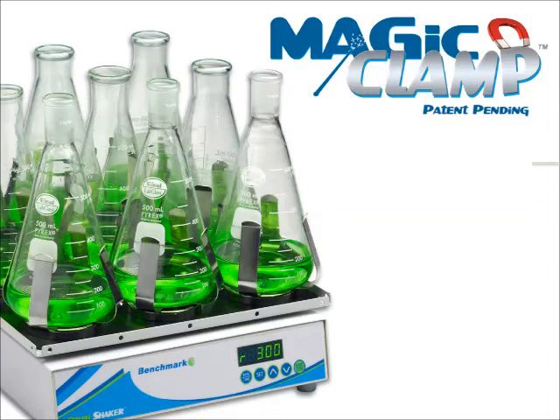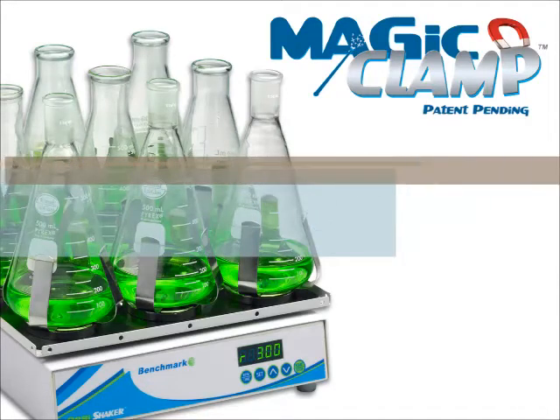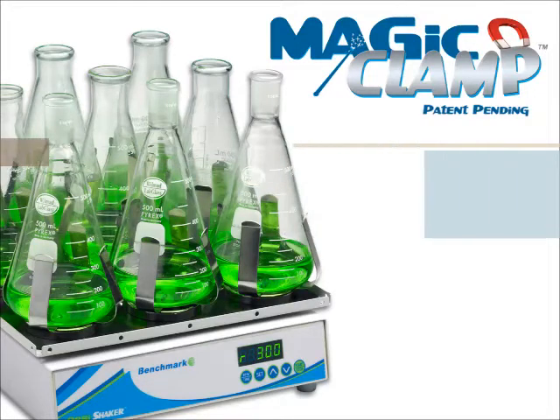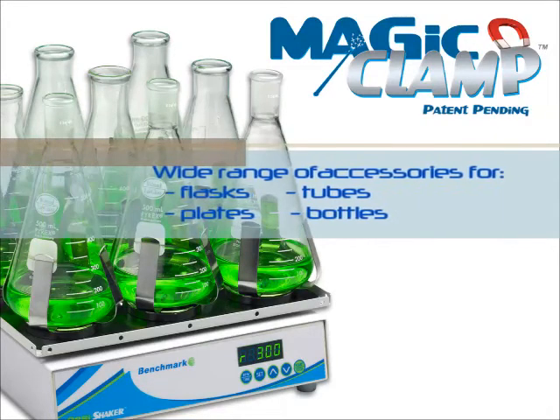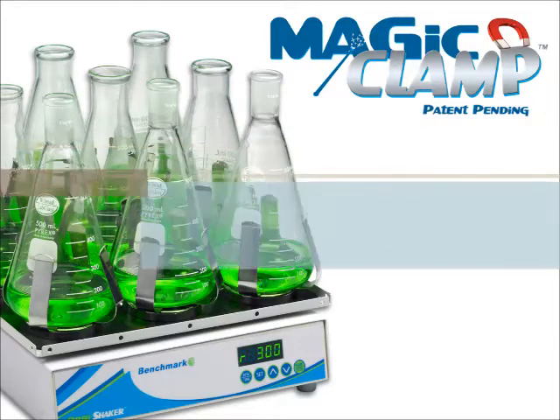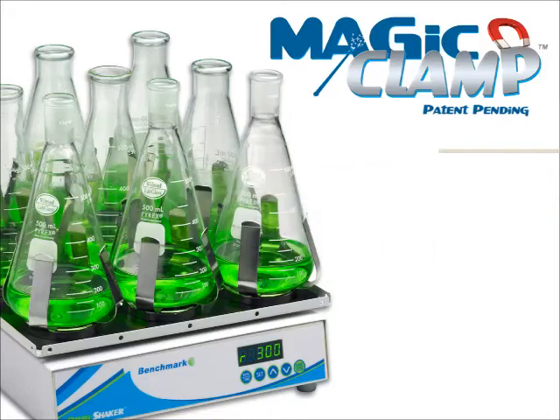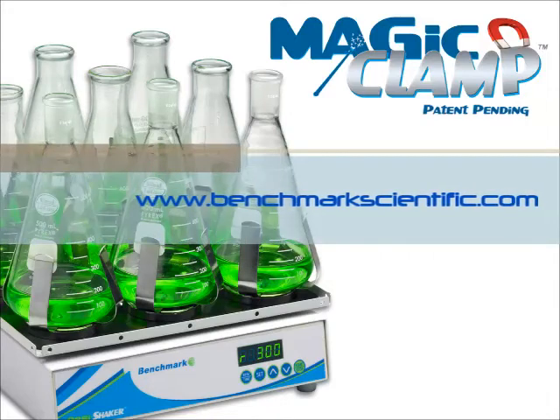The Magic Clamp System from Benchmark greatly reduces the amount of preparation time associated with orbital shaking, and offers flexibility over a wide range of applications. For additional information on our Magic Clamp System or any Benchmark product, please visit www.benchmarkscientific.com.